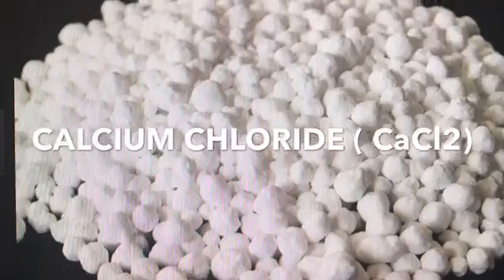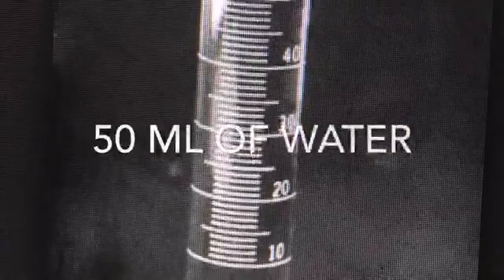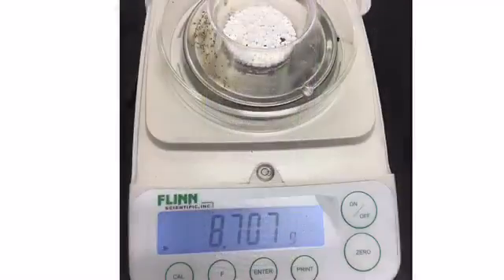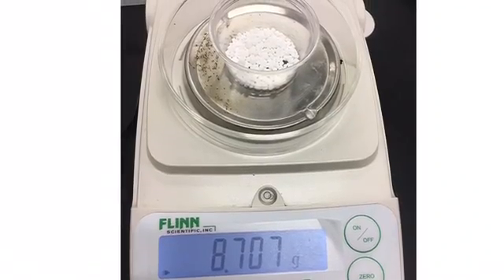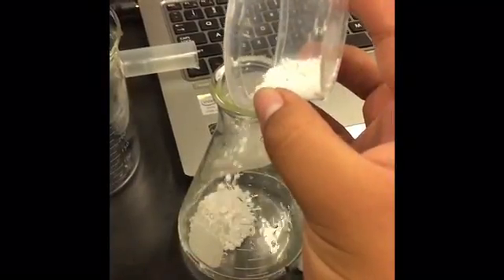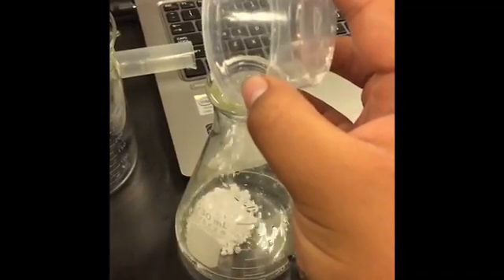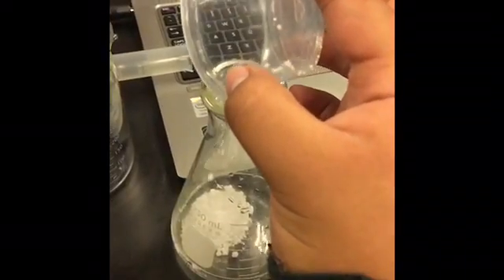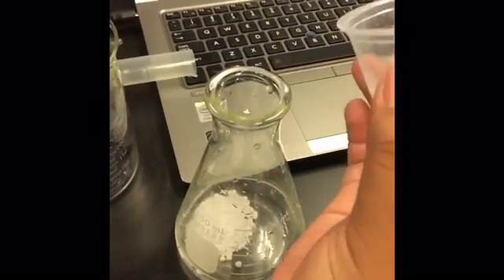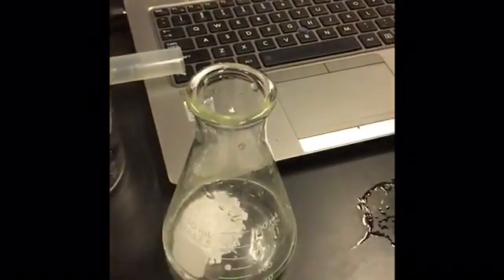Experiment number two: we used calcium chloride and 50 milliliters of water. First, we set up for the experiment. Next, we placed 8 grams of calcium chloride in a plastic container. We poured 50 milliliters of water into a 250 milliliter Erlenmeyer flask. We poured the calcium chloride into the water and stirred it until it completely dissolved.